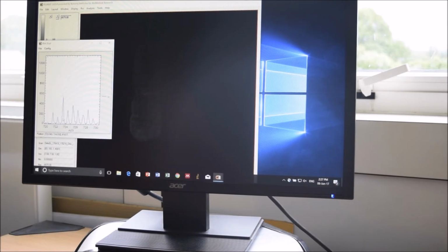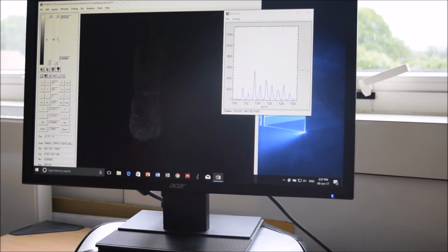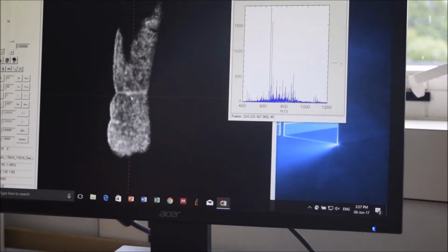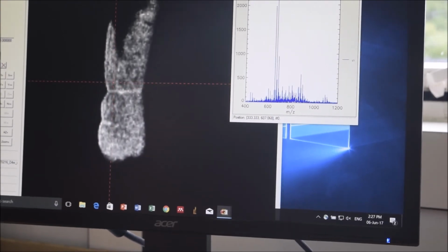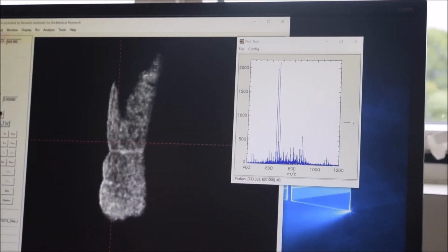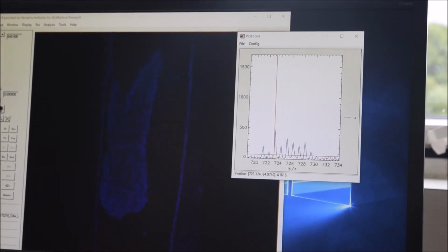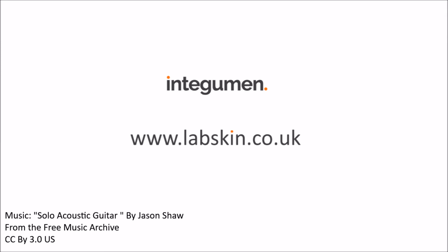From the spectra, single molecules can be looked at, creating a coloured image based on its concentration across the sample, identifying which molecules are involved in the wound healing process. These molecules can then help assess people who have wounds to make sure they aren't developing a chronic wound, therefore reducing the national health budget burden across Western world countries and improving the patient's quality of life.